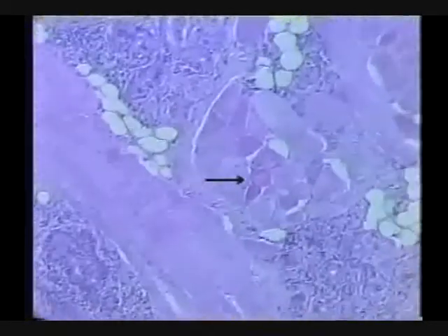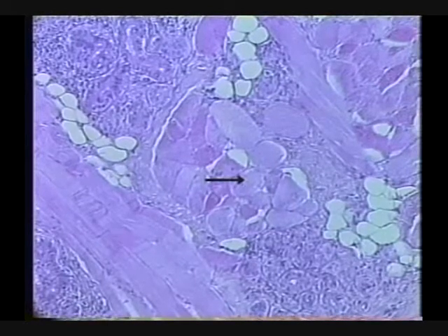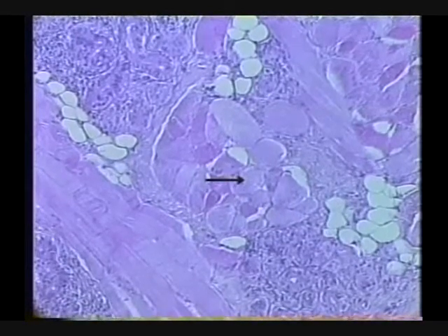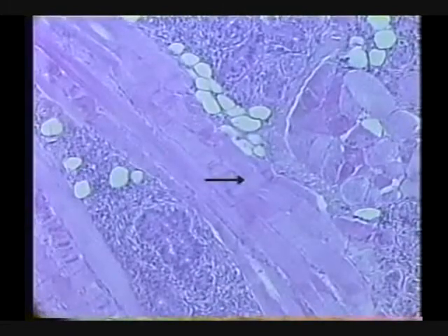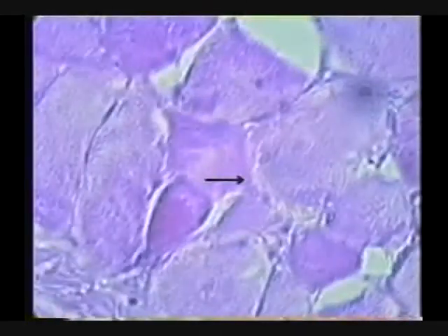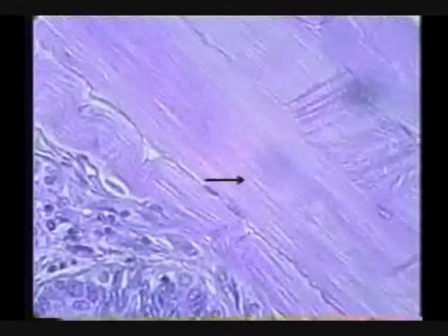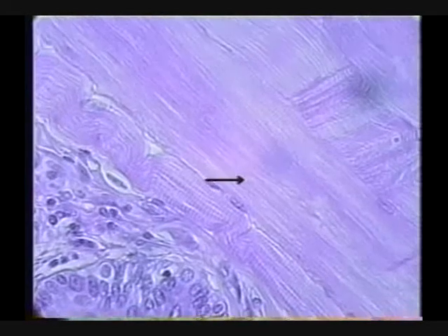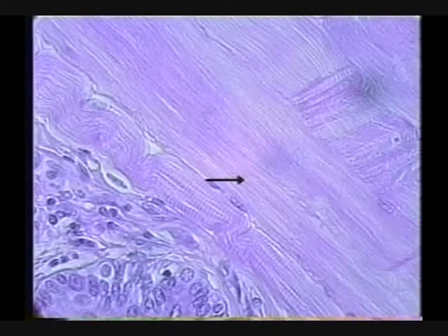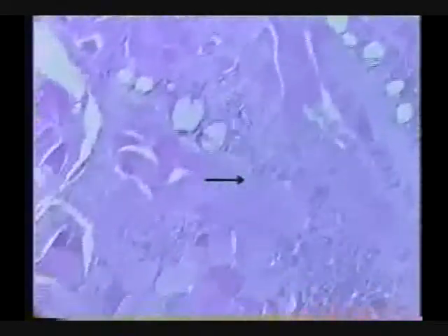What perspective is covered by the arrow? Cross-section, yeah good. And what perspective is this? Longitudinal section. So we can see those things if we go up to a higher power. Now we can begin to see some peripheral nuclei in the cross-section. We can begin to see there are some striations below the arrow. That confirms, yes you're right, that's good skeletal muscle. Why do we have skeletal muscle going in various directions here? Longitudinal, there's some diagonal, there's some cross-section, just going around in all directions.